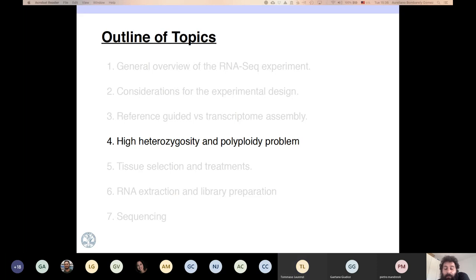No. No. No. Okay. At this point, we need to map the reads to a reference to perform any transcriptomic analysis. In order to quantify the expression of the genes, you need to map to a reference. The thing is that sometimes if you don't have the reference, you need to build a reference yourself with your own data set. But you always need to map to a reference. I'm not sure if there are some modern methodologies that may use a different approach, like k-mers. But I would say 99.99% of the time you will need to use a reference. You cannot not use it. Okay, thank you.